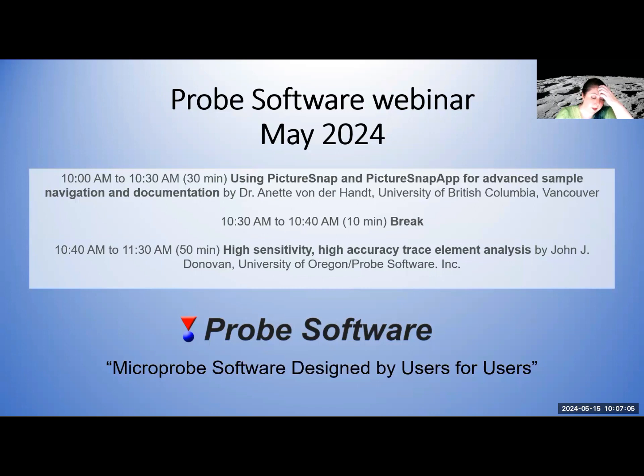While a lot of the nitty-gritty details of the advanced analysis remain kind of a black box to users, this navigation and documentation is the first thing that they really appreciate, specifically if they've been using microprobe analysis or other technical analysis for a longer time, because it has really improved compared to how I did it when I was a PhD student.